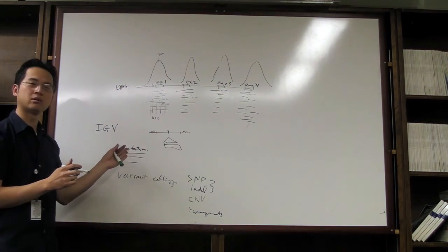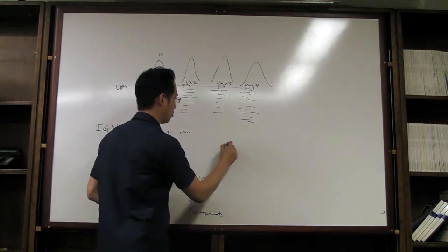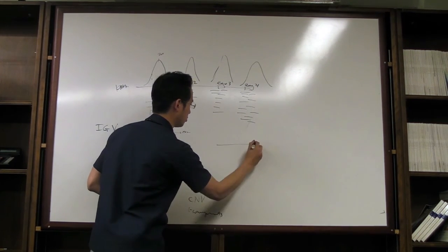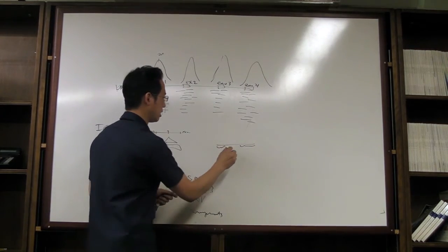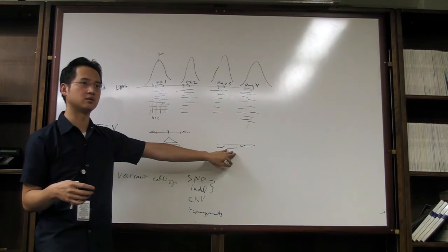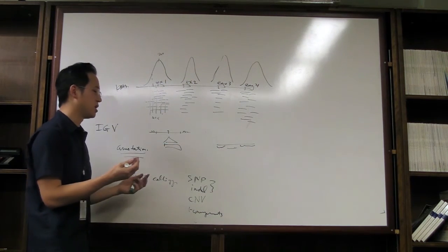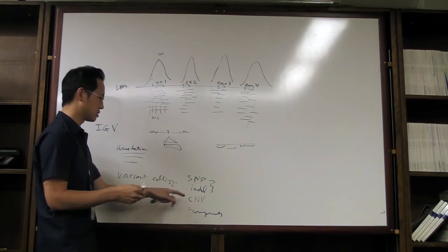So there are certain other aligners that are better at this. Certain other aligners really start mapping on one end of the read. So, sorry, this is your read. They maybe map this in first, they map this in separately, and then they move in from there. So it's a little bit better algorithm. A bit more complex, more computation intensive, but these are designed to better map indels. But other ones like BWA, sometimes they don't perform so well with indels. So that's a little bit tougher.